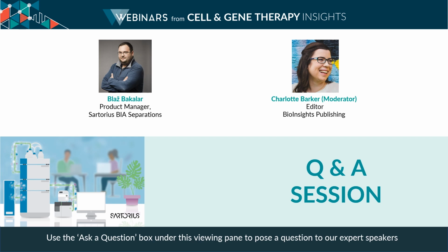Brilliant, thank you. And next question, how can you disrupt the LNPs over the column? Is it on column or outside? Oh, it's actually on the column itself. That's why when I saw this method being developed, I was kind of shocked by it, like very cool.